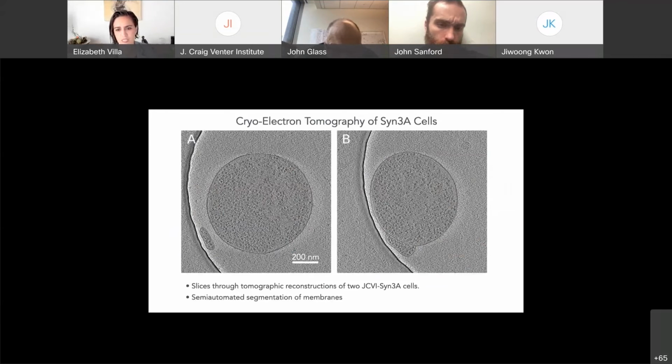And so here you can see two little cells. This is about a 200 nanometer scale bar, and you can see these cells look a lot like wild type or mycoplasma. And the idea in this first approach, as I said, was basically to try to provide information for, you heard probably Zane earlier today or last week, I can't remember, showing how this was going to be used to figure out where the chromosome was originally.